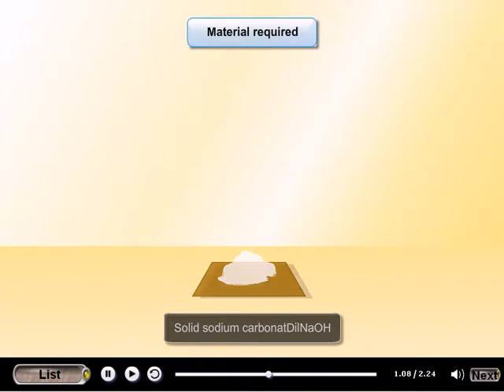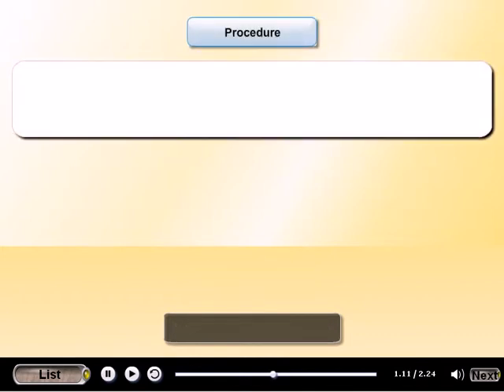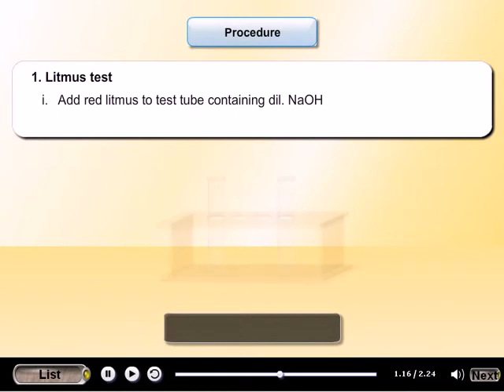solid sodium carbonate. Procedure. Point number 1. Litmus test.